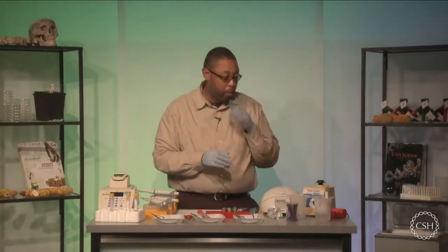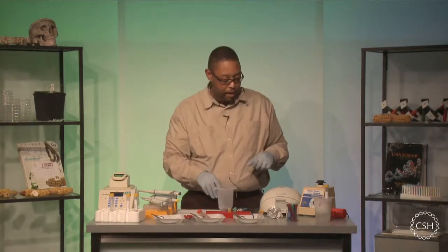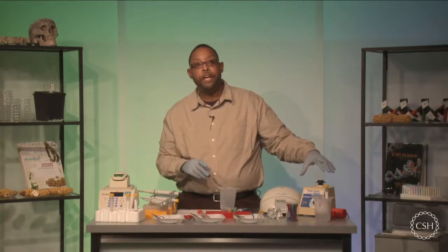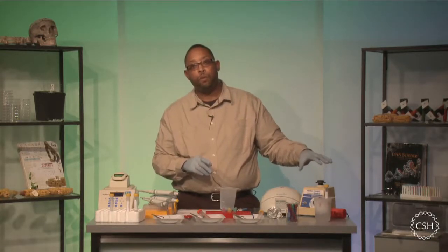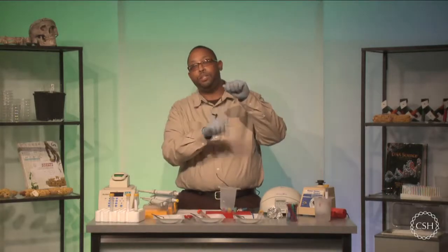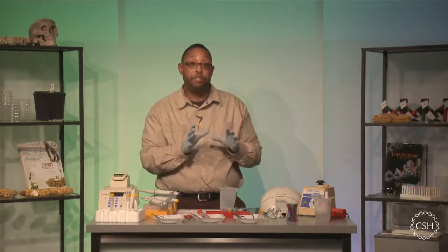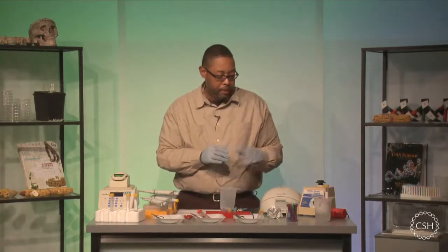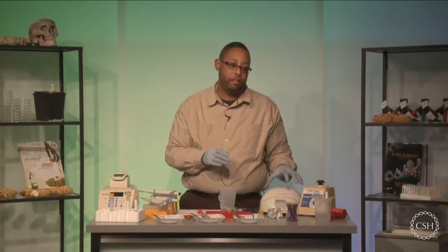Now, some other pieces of equipment that I have over here that are sort of pushed to the back is my vortexer. If you do not have a vortexer, finger vortexing will work just as well. All I want you to do is just basically use your finger to tap onto the test tube, and you'll see me do that as I go through. I'll make sure I demonstrate both methods that are physically there. And then, of course, lastly, I need physically to have a microcentrifuge, and I'll have one here.